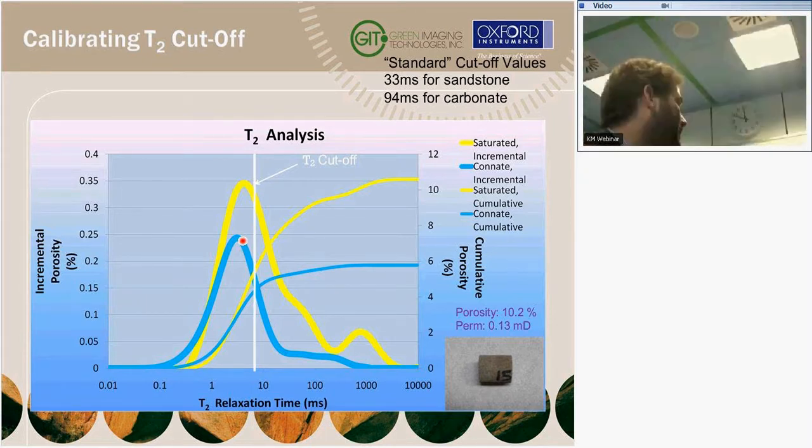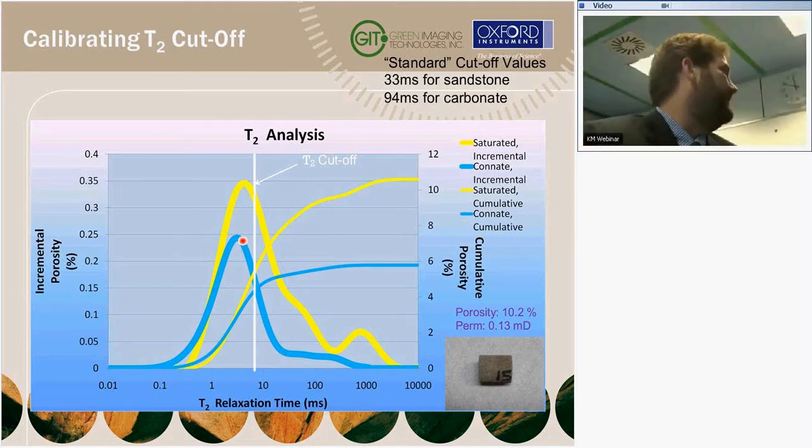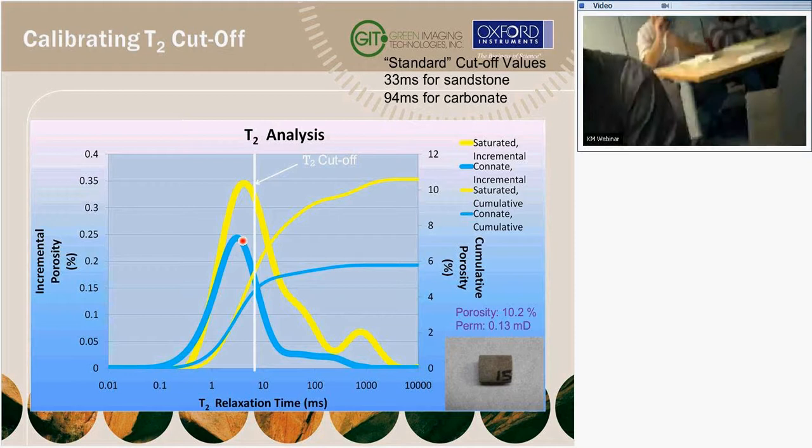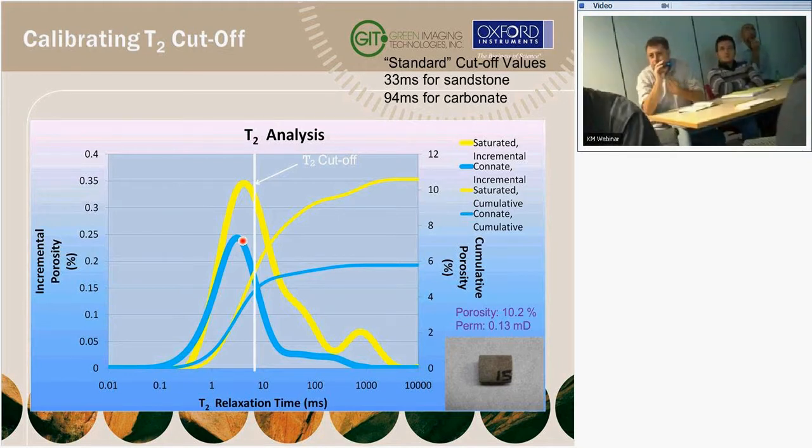Asking is can NMR see enough of the fluid? Yes, because in a gas shale system, the fluid that can be activated by NMR is small. Do you think that the signal is enough to have this kind of good typing with the T1, T2 mapping?